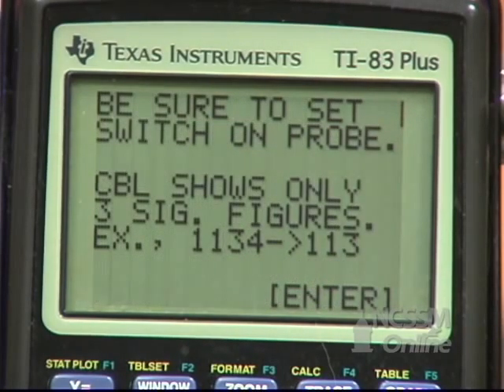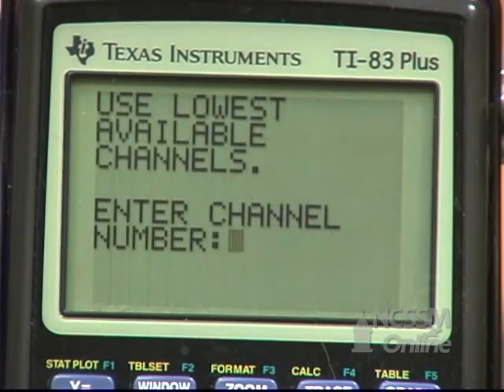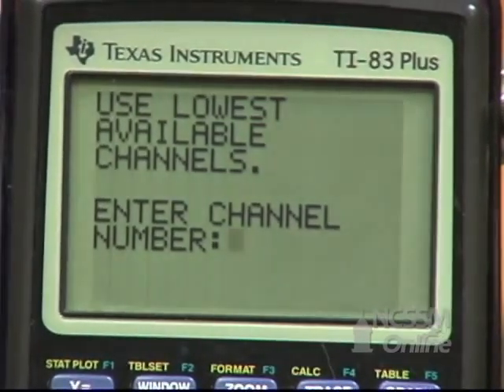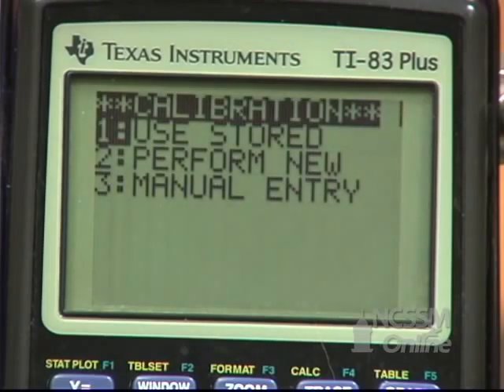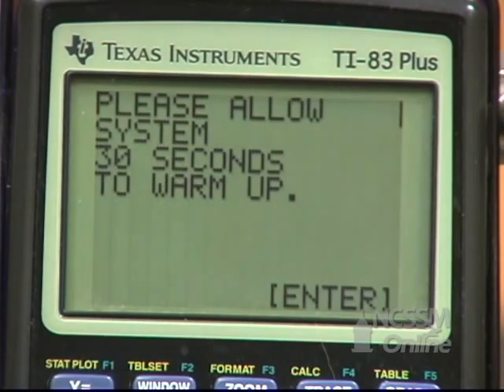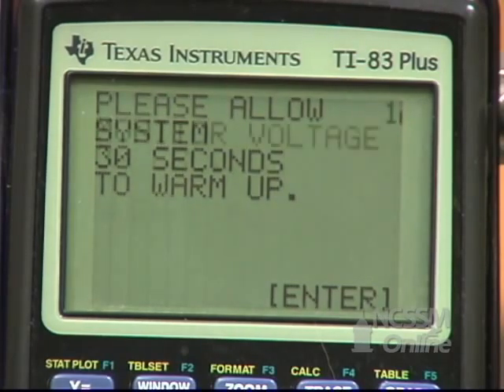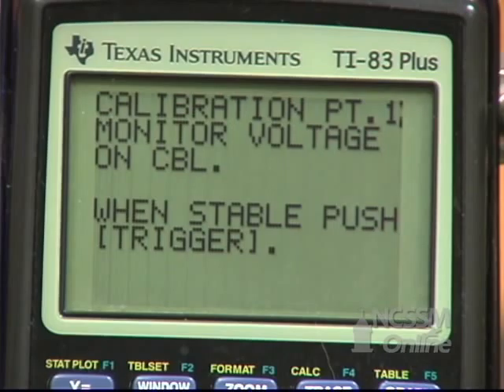We're going to set the switch on the conductivity probe to 0 to 2000. It's in channel one. We're going to perform a new calibration. We're going to wait 30 seconds for it to warm up, then press Enter.